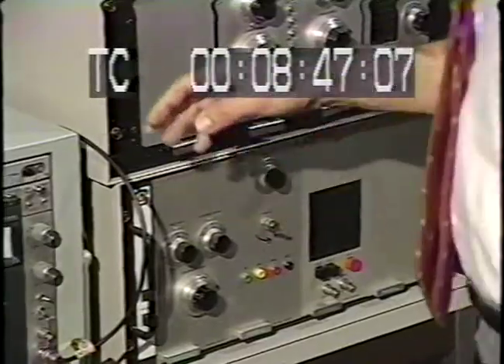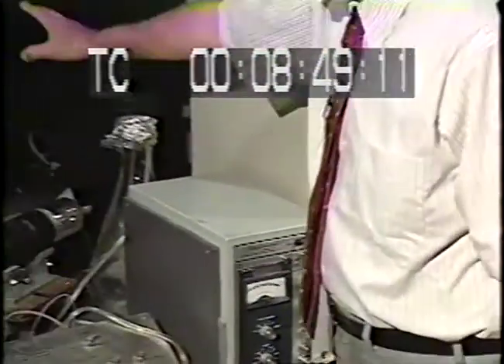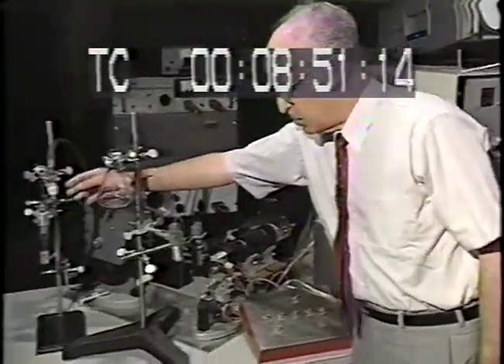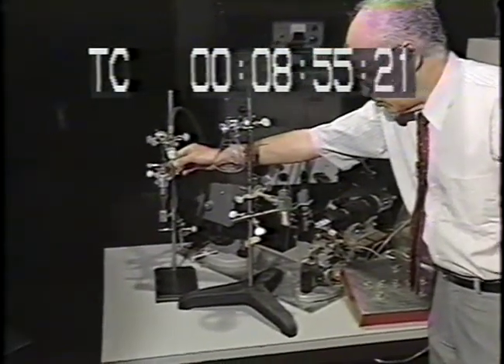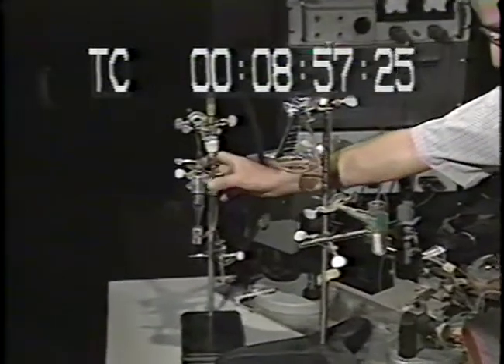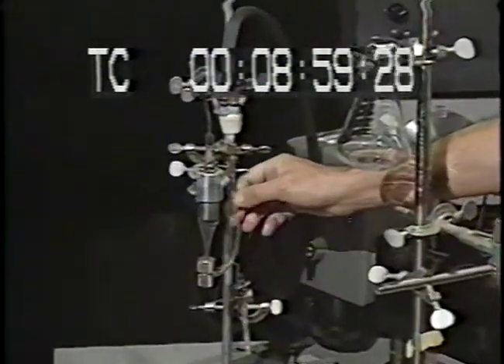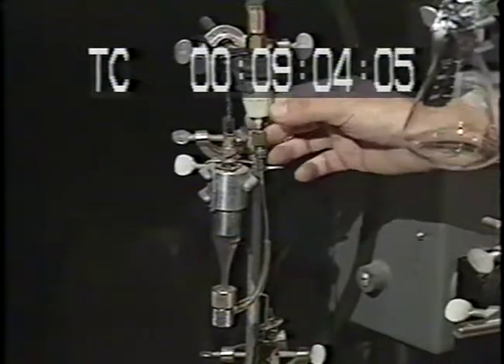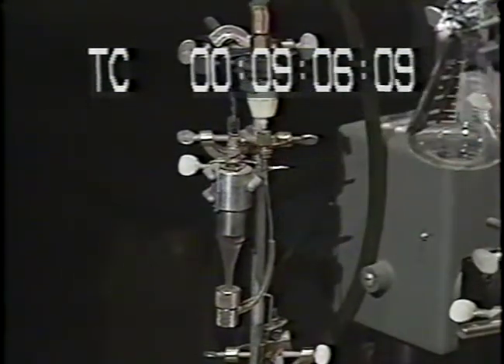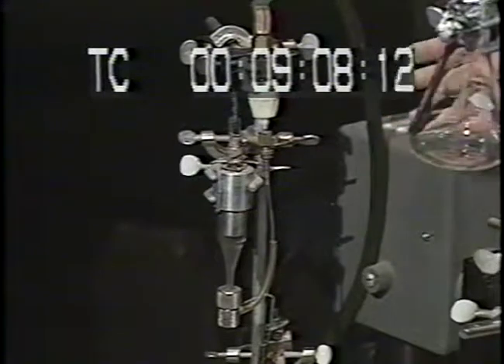The sorting part is in the back and over here. This is the most important part of the sorter, an oscillator, but I never worked with it, so this instrument has never been used really. It's brand new.